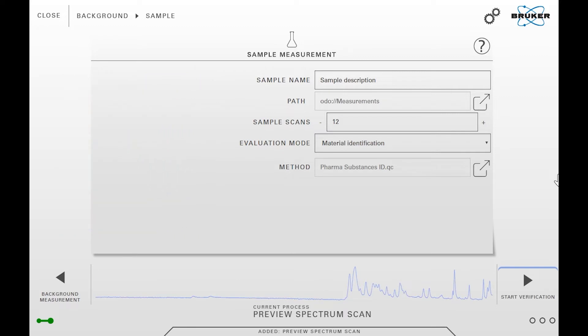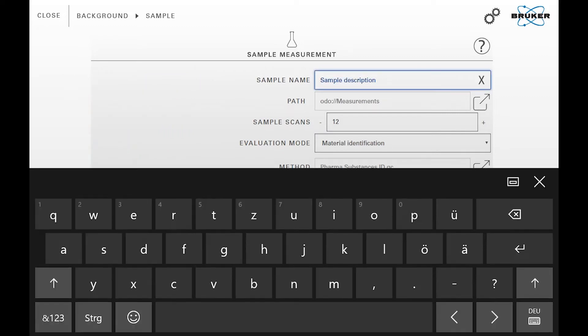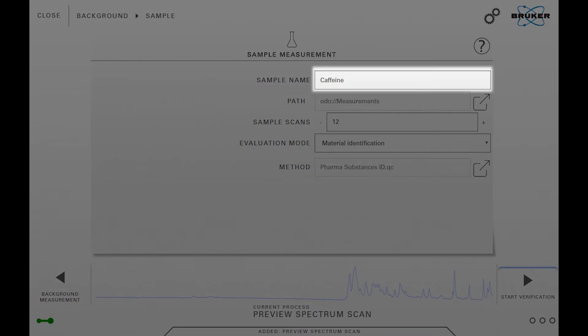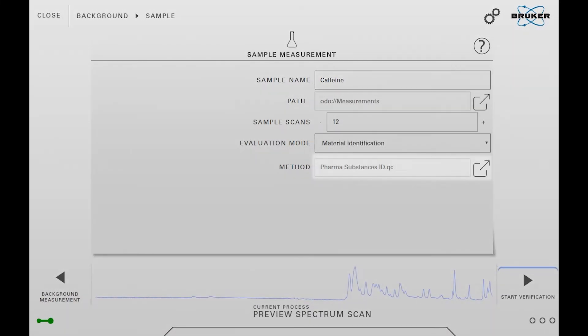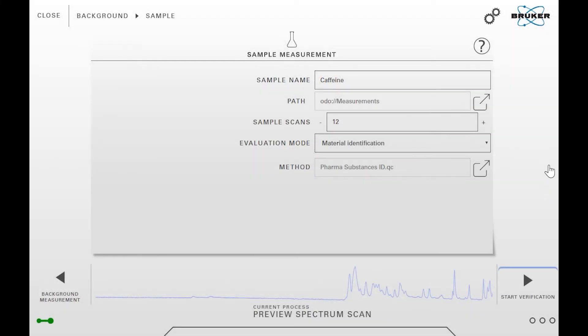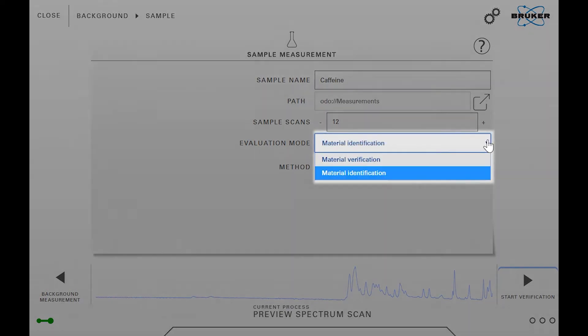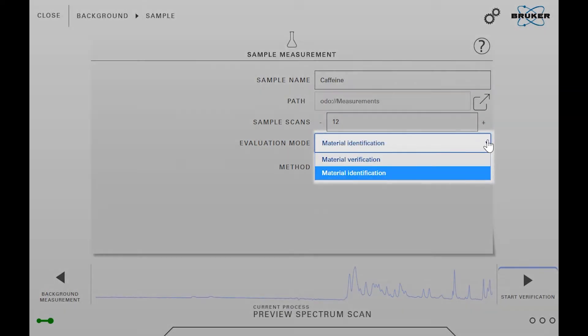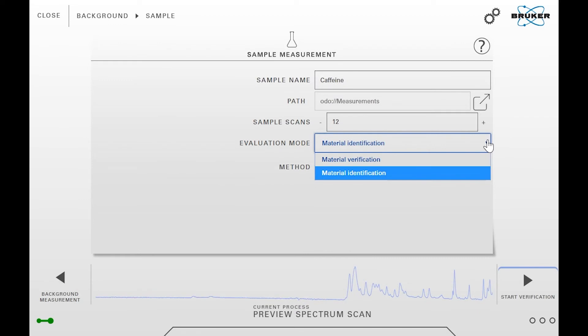You can then enter the sample information. Besides the sample name and the quick compare method, you also have to select an evaluation mode. The available settings are material verification and material identification.